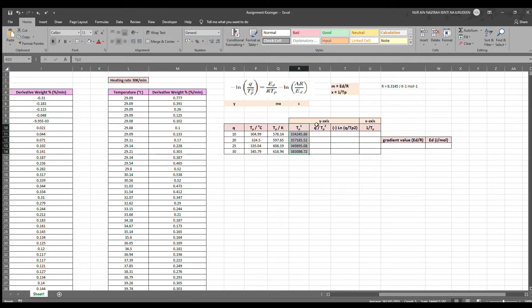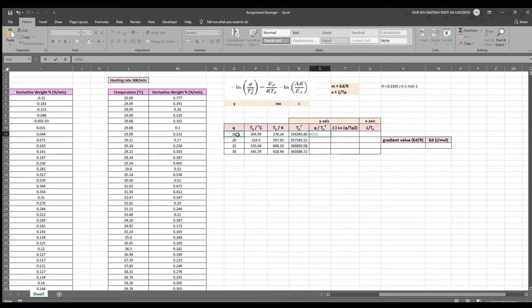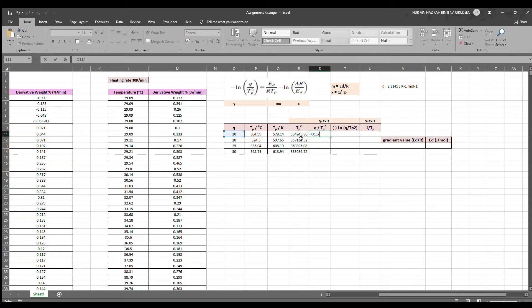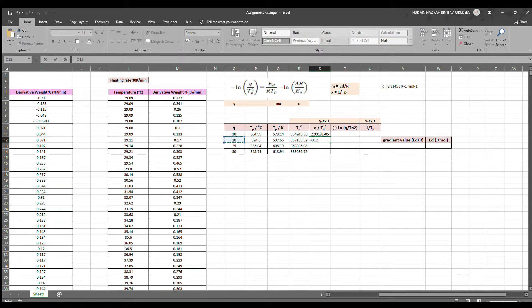For Q over TP squared, we just have to click on the corresponding Q. In this case, this is 10 and we divide it over the TP squared value that we just calculated. We do it for 20, 25, and 30 as well.